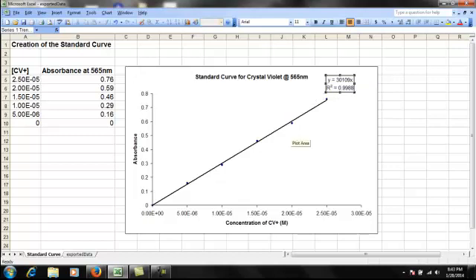Now, I'm going to take this to do the rest of the data analysis. Part 2 of the experiment, which we are going to be doing on the 29th of January, which is tomorrow as I record this, but when you are watching this, probably today. In that part of the experiment, you're going to make absorbance measurements during the reaction between crystal violet and sodium hydroxide.